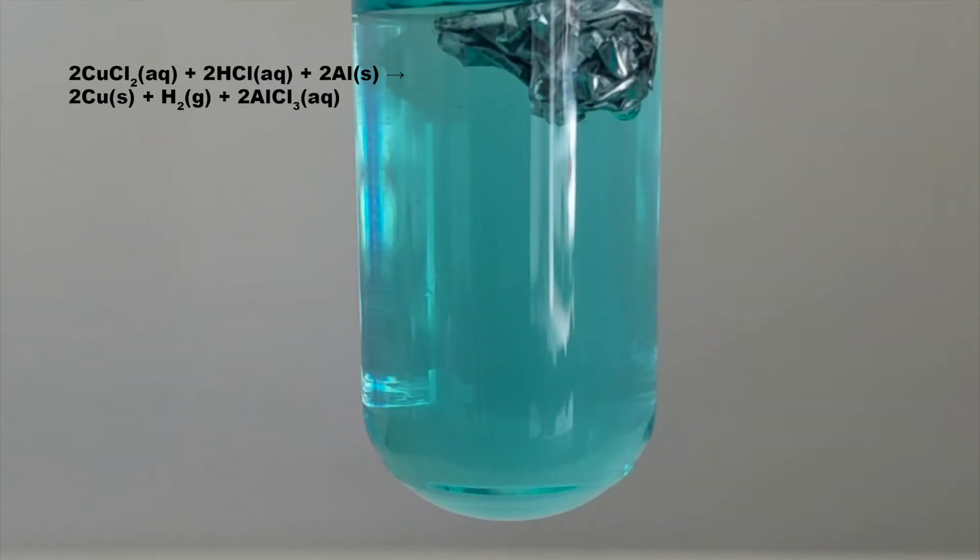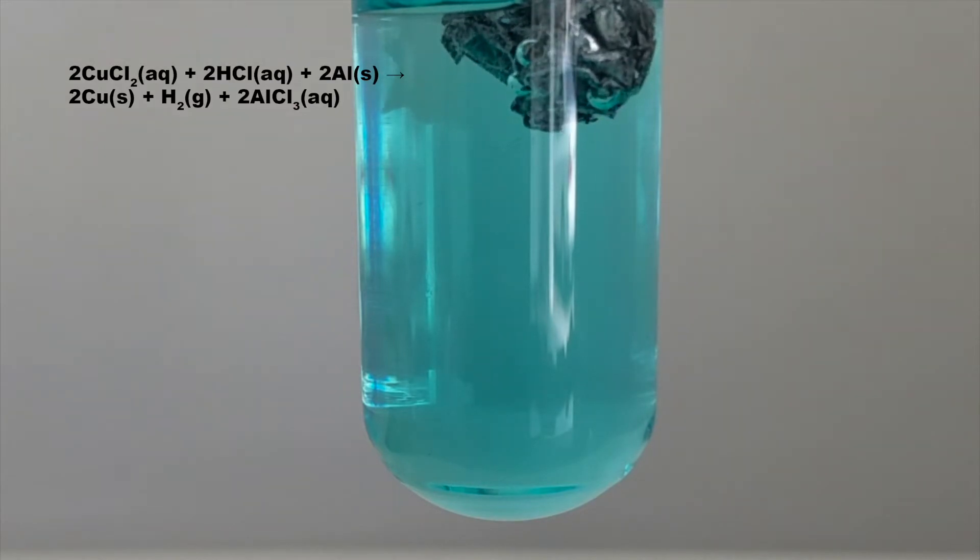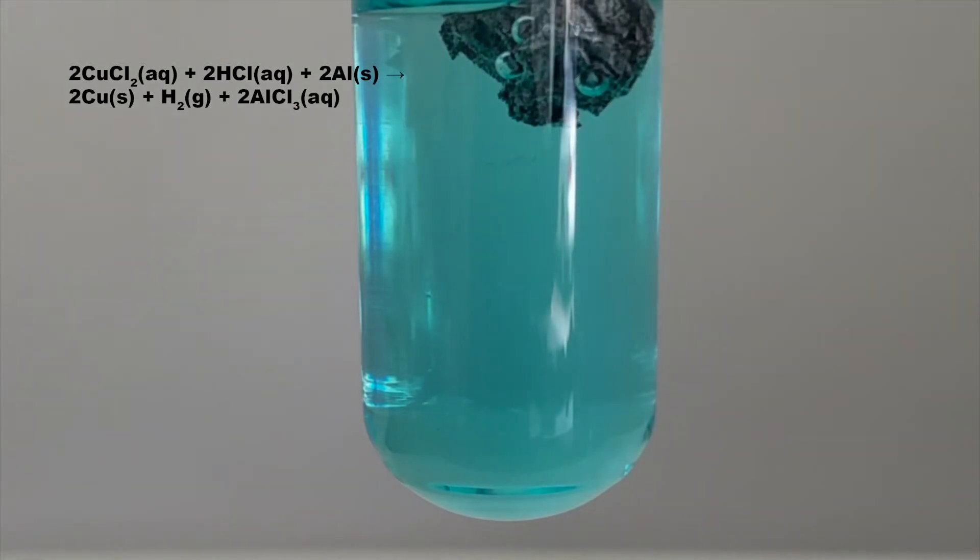I add a small chunk of aluminum foil to the solution, which at the beginning reacts slowly. However, over the course of the next few seconds, it builds up in speed, and you can see hydrogen gas bubbles forming and the red copper precipitating out of solution on the aluminum metal.